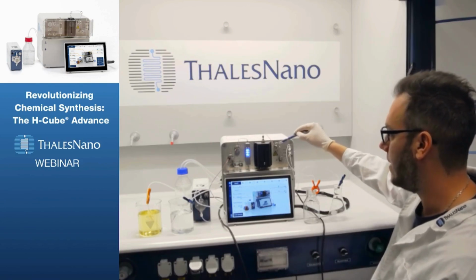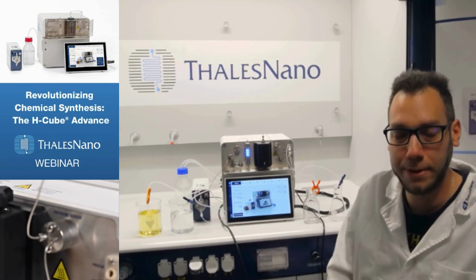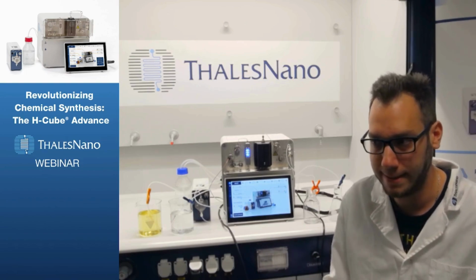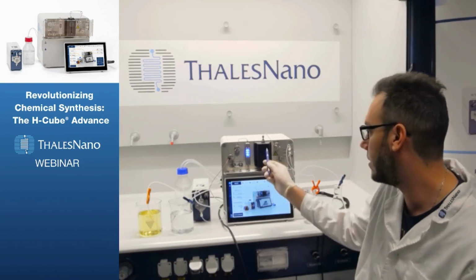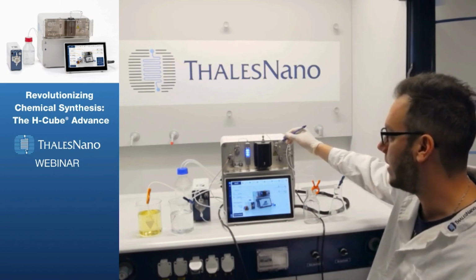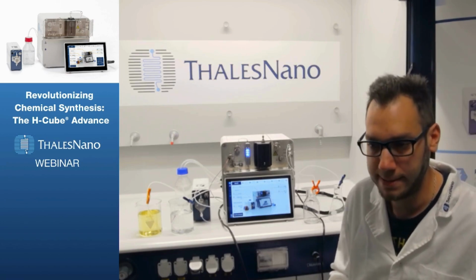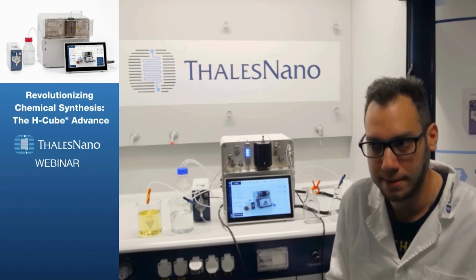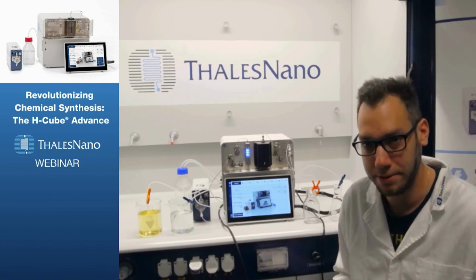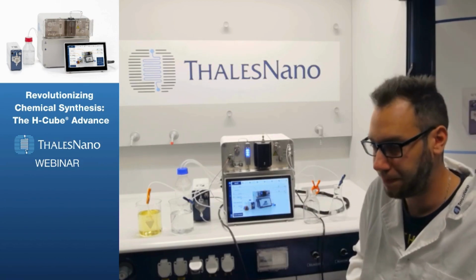The next stop within the flow path is the pressure sensor, another pressure sensor. This is the outlet pressure sensor. So once again, this will give you the difference between the inlet and the outlet side of the catalyst cartridge, the column. And this is also what we consider to be the reaction pressure. So in flow chemistry, it's a well-known convention to define reaction pressure as the back pressure, the outlet pressure of the system. So this is what we regulate the pressure for.